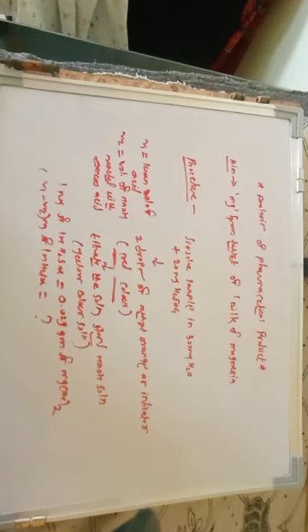You should remember that the assay of magnesium hydroxide follows the acid base reaction, in which we cannot use direct titration because milk of magnesia is insoluble in water, and therefore you have to use a back titration process for the determination of magnesium from the milk of magnesia.